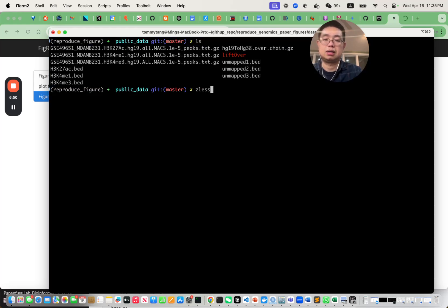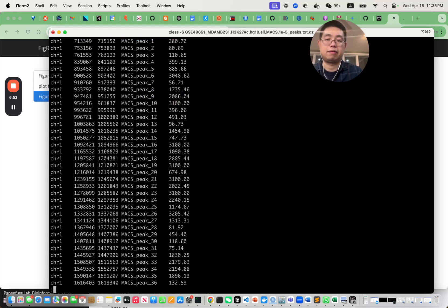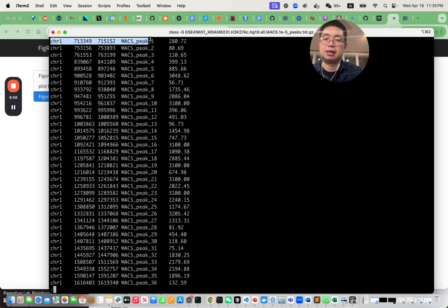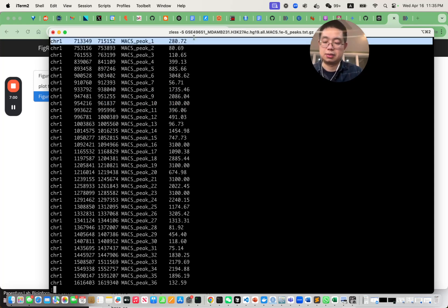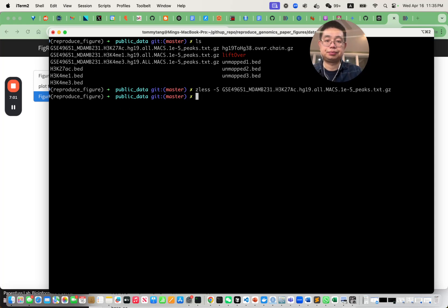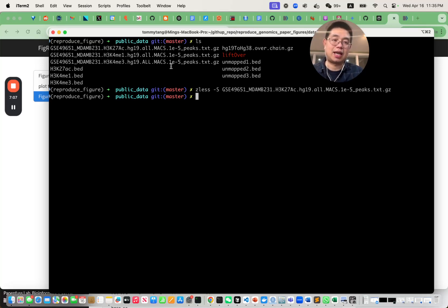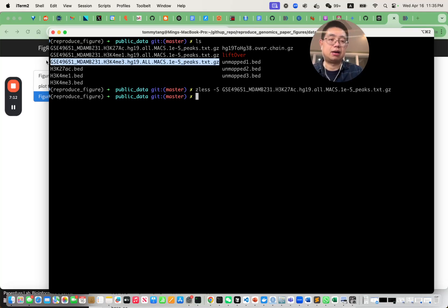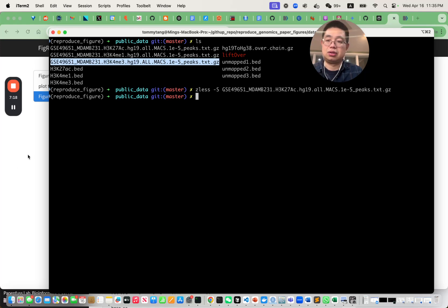If you look at one of the files, those are MACS2 peak calls — a BED file with chromosome, start, end, name, and scores. The problem is that we aligned our data using the HG38 human genome, but these peak files are in HG19, so we need to lift them over from HG19 to HG38.